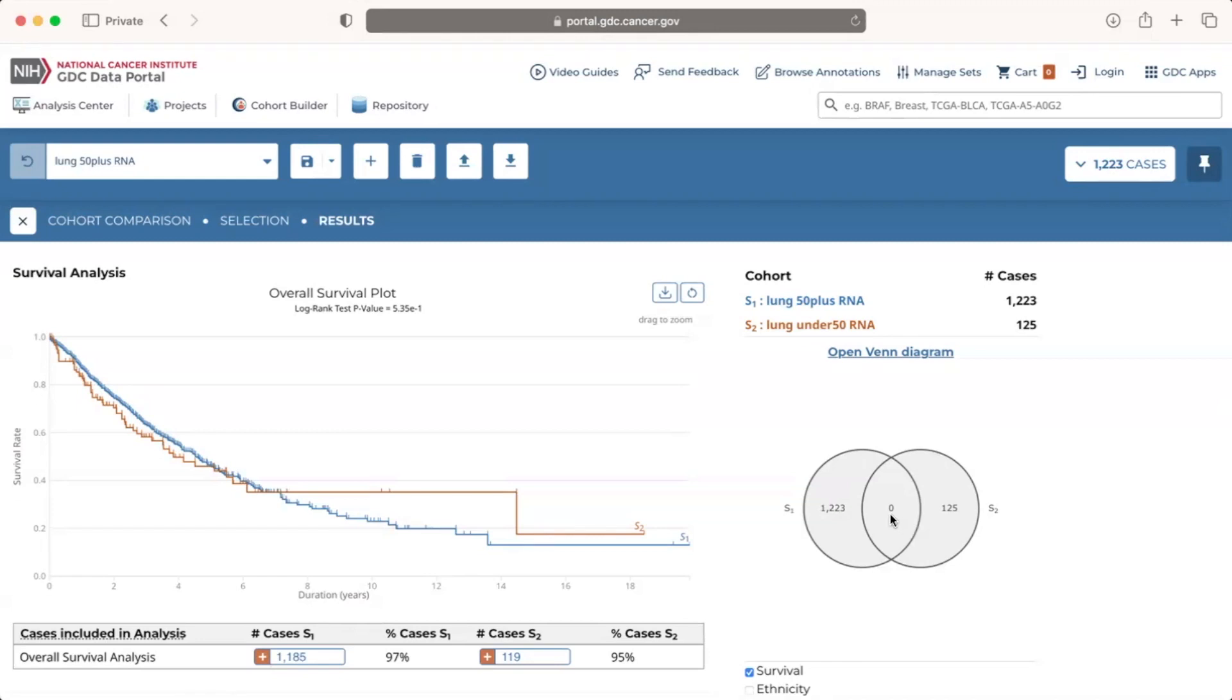This is expected since our two cohorts are exclusive of one another based on the under 50 and 50 plus age filters. Clicking on the open Venn diagram link will launch the set operations tool which will be discussed in the GDC set operations tool video.